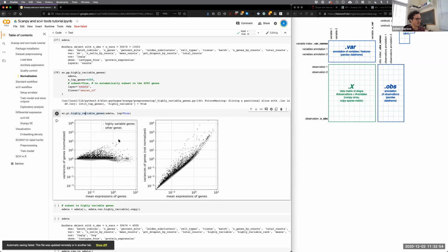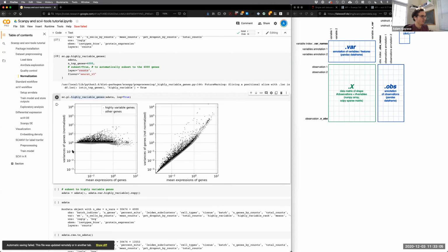And then basically it's taking the most highly variable genes; you can think of just looking at the y-axis and going from top to bottom. In the Seurat workflow, they usually use 2000. I think higher is usually better, but there's probably strong diminishing marginal returns after a while in terms of how informative each gene is.